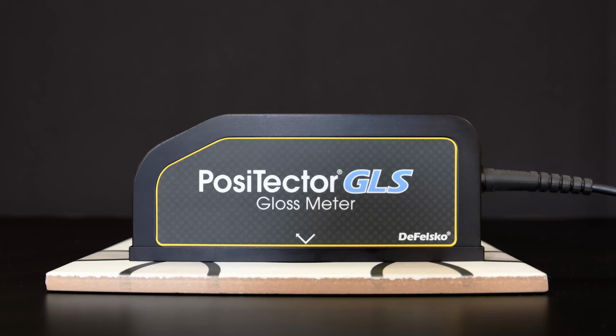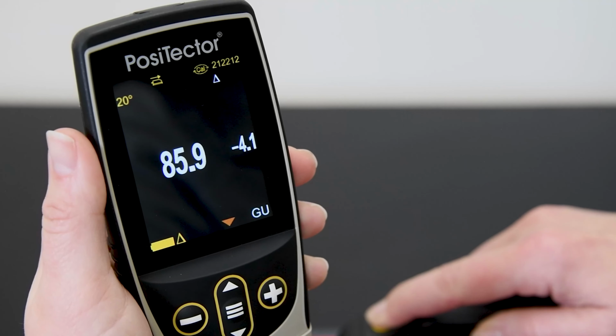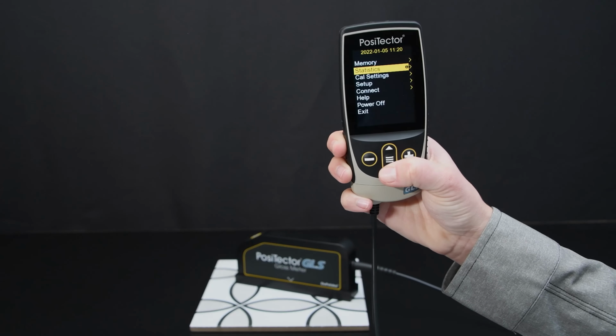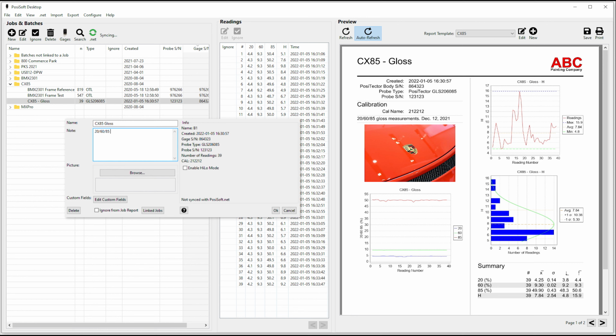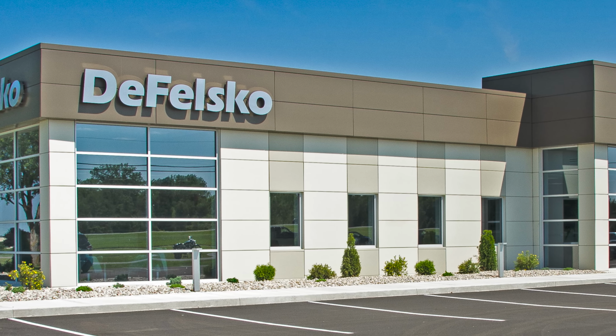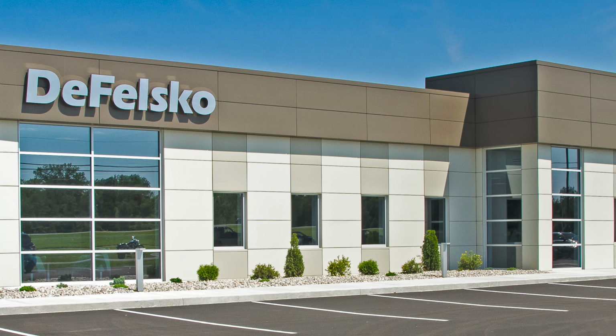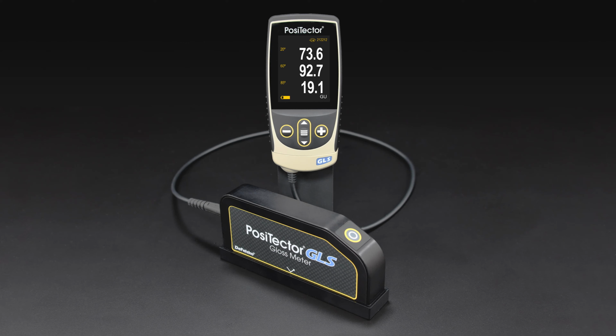The new PosiTector GLS Glanzmessgerät is the simple, durable, and accurate way to measure gloss. With an easy-to-use interface, fast measurement speed, onboard memory, and easy reporting solutions, all backed by DeFelsko's renowned quality, customer service, and exceptional 2-year warranty, the PosiTector GLS Glanzmessgerät is the ideal choice for gloss measurement.